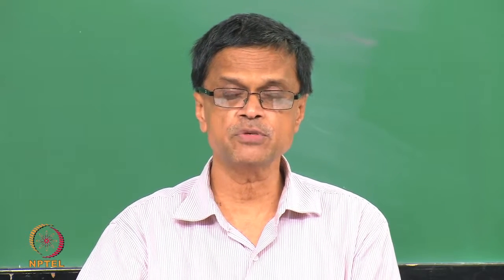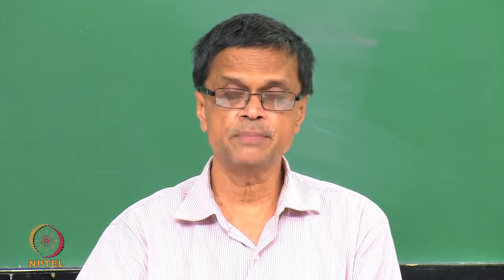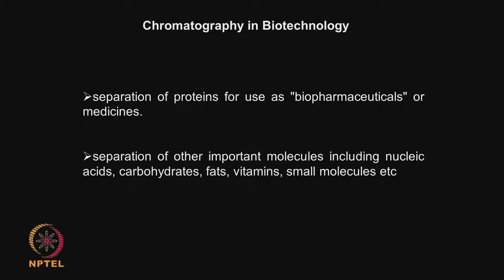So, chromatography is extremely efficient and there are different types of chromatography operating on different principles, and that is what we are going to spend some time on. We will be spending almost 4 classes on chromatography because it is a very involved topic. It is used for separation of proteins, especially in biopharmaceutical industries, for medicines. It is used for isolating pure enzymes. So, it is widely used.